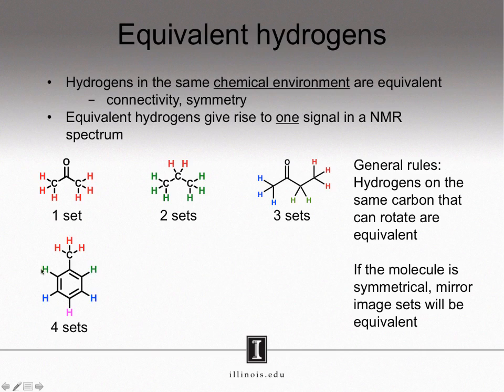Why are the green protons chemically equivalent to each other? This is because of symmetry. If I draw a line right through the middle of this molecule, I see that I can rotate this molecule and flip it so that the green protons swap and the blue protons swap. One final, more tricky example.